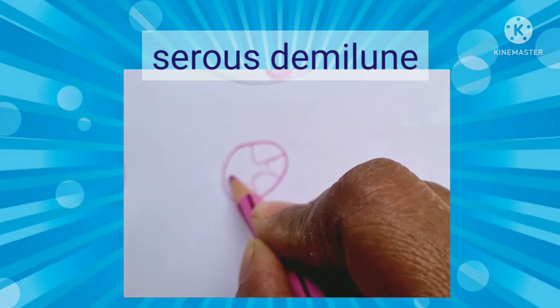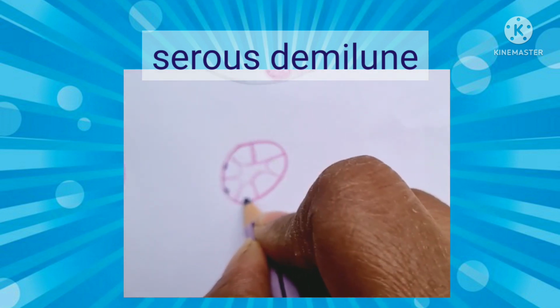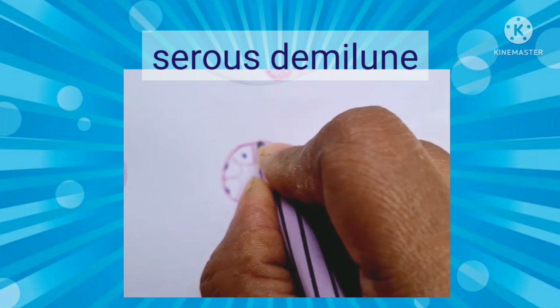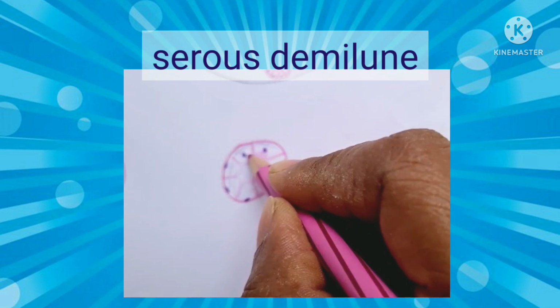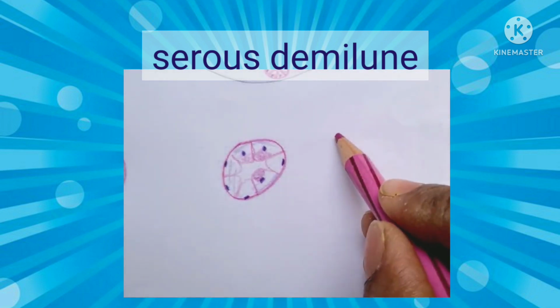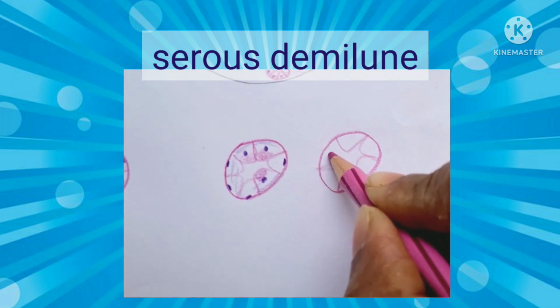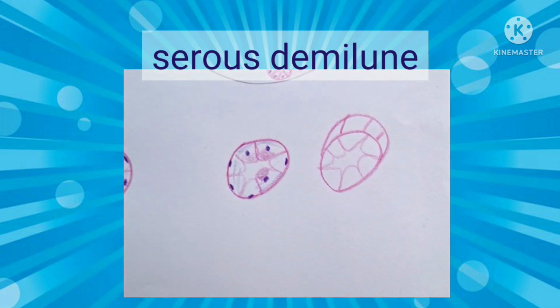So coming to the demilunes, demilunes are like an artifact during preparation. They have studied that if they use a freeze technique, they will find acini which contain both serous and mucous cells in one acinus. But when they do the H&E staining, due to a preparation artifact, the mucous cells will swell up, pushing the serous cells towards the top, forming the demilunes.